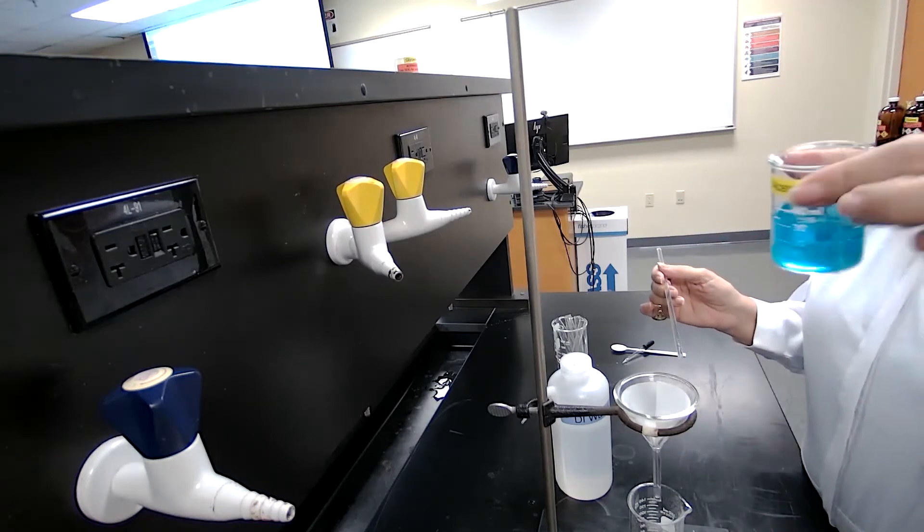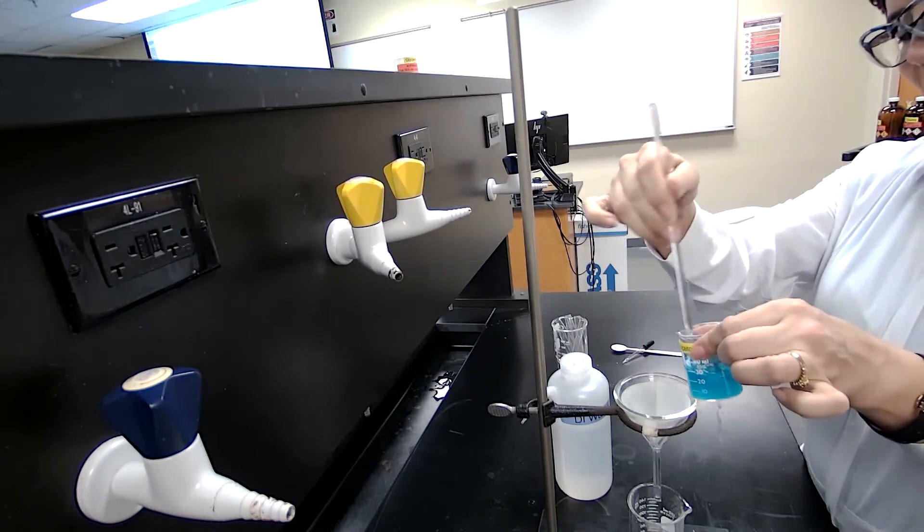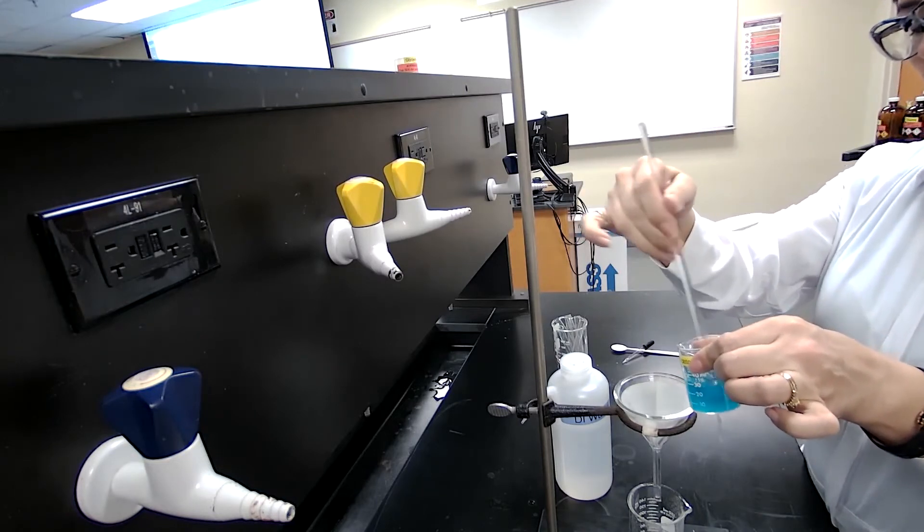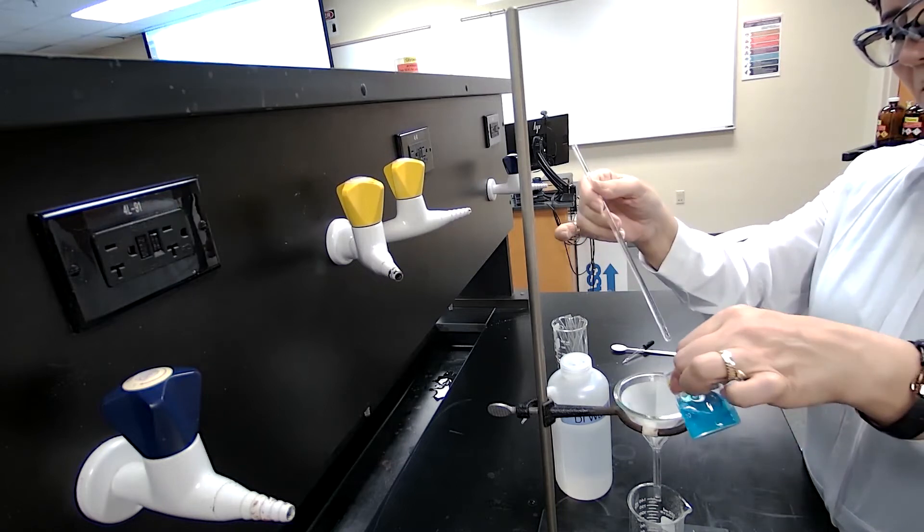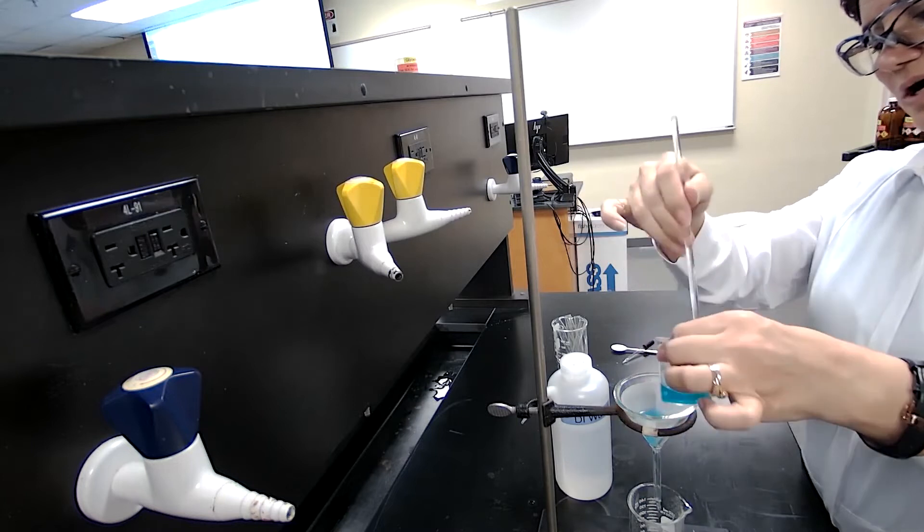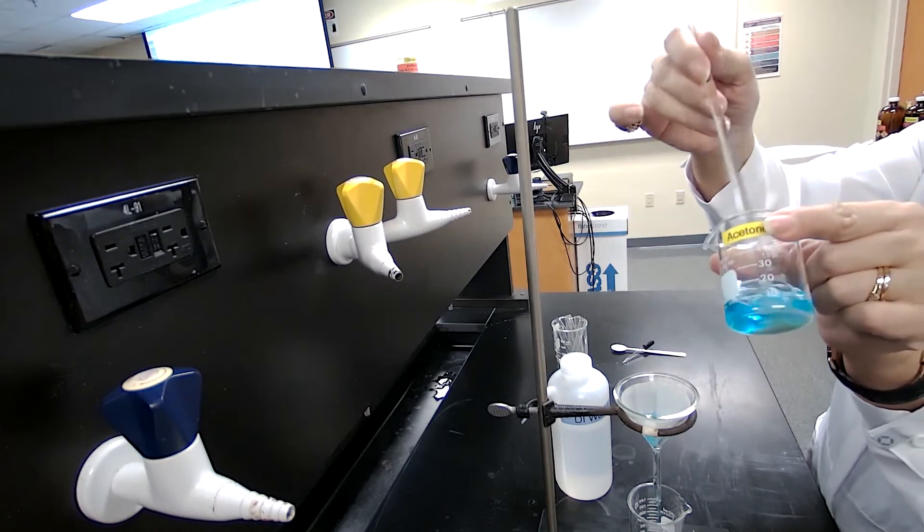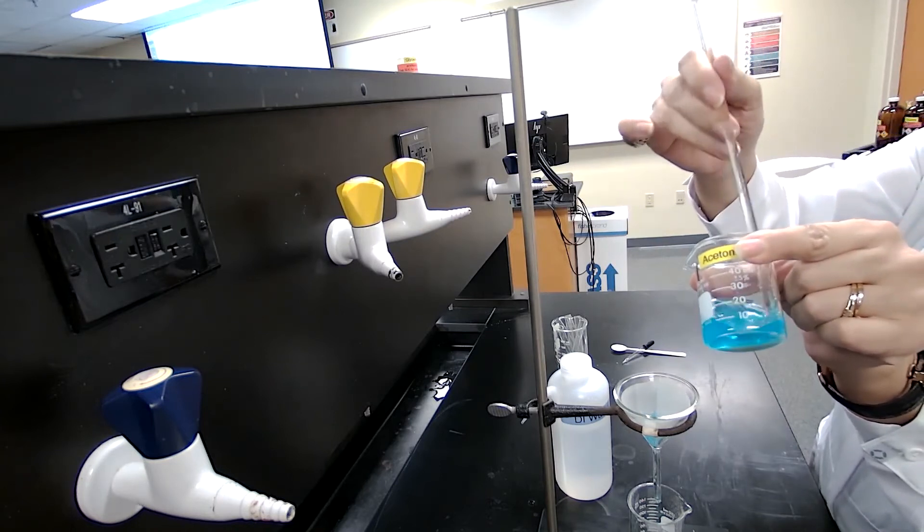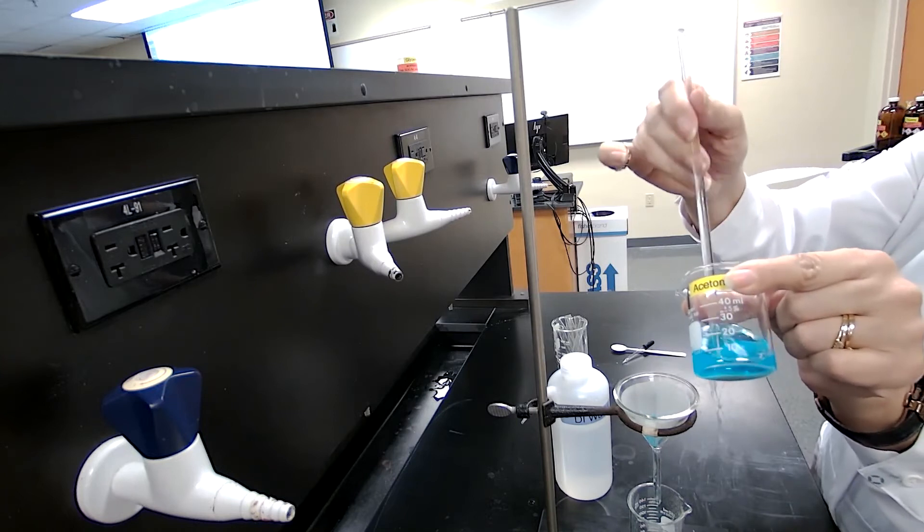So I'm going to pour the mixture through the filter paper. Because I want to transfer both components, I mix it to make sure that everything transfers. Otherwise, the solid piece, especially in this case where we have sand for this part of the experiment - it was sand and copper sulfate - the sand is heavy and it's going to stay in the beaker.